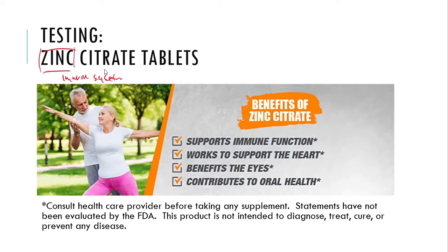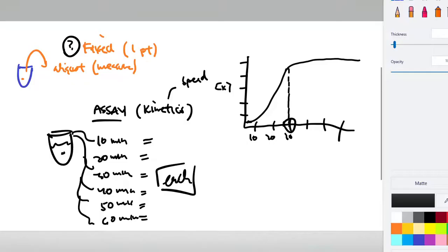All right, so these are the tablets that we're going to be working with today. They are zinc citrate tablets. They are going to break apart, because they should, and they are going to release some zinc, and they're going to release some citrate. All right, now here's the thing.